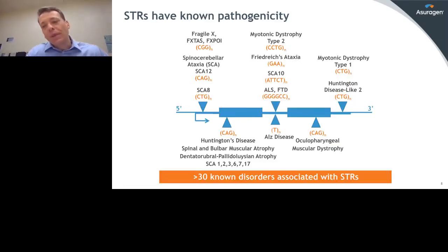We have repeats that are dark in sequence, but are increasingly discoverable thanks to long-read next-generation sequencing as a discovery tool. We have repeats that are dark in function, but are increasingly knowable because of our understanding of the linkage between STRs, gene expression, and also potential association with disease.